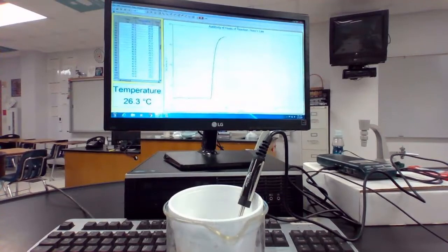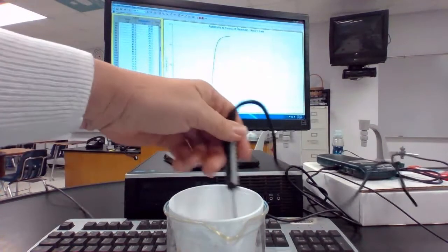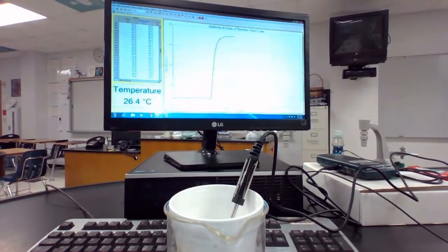There's our scale, and we're getting quite a difference in our reaction. And you might think about, well, why is that difference in our reaction happening like that? This had to do with a difference in the states of matter of your reactants. In the first reaction, we had a solid being dissolved in water, a liquid. So we had the dissolution going on. This one was both two chemical reactants that were both aqueous. That means the ions are both in solution already.